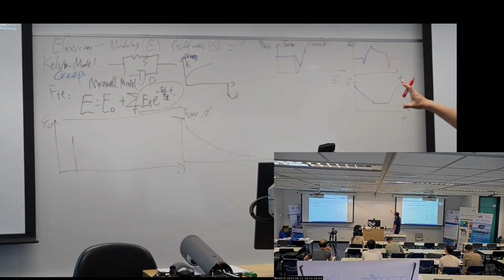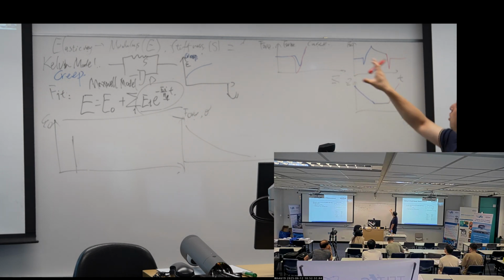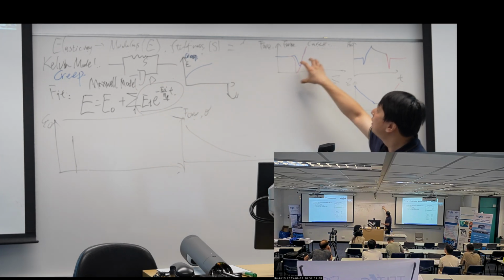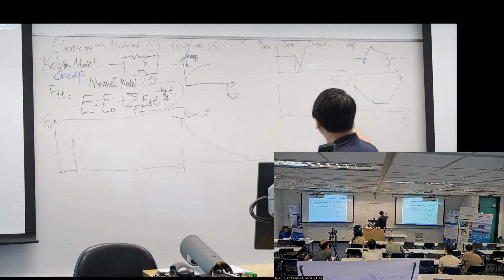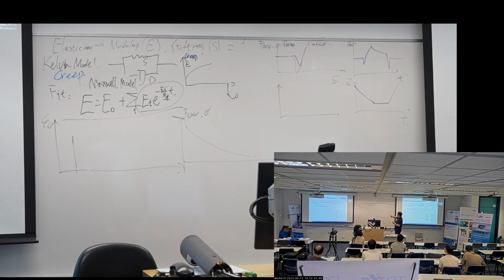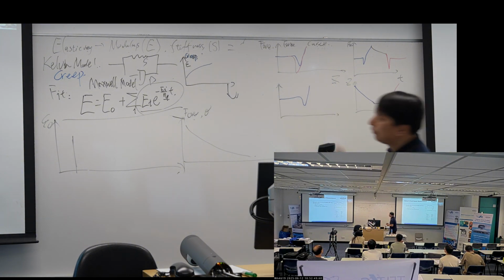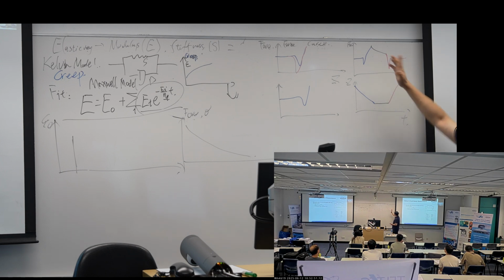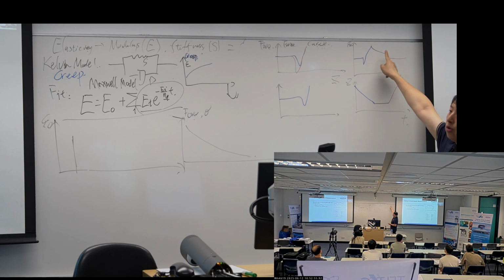And if we try to capture the force curve back, if we still want to draw something like this, we may observe our force curves to be, but after we retract, our force is already reduced.